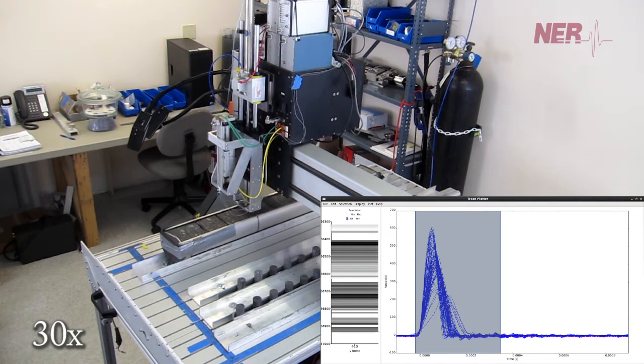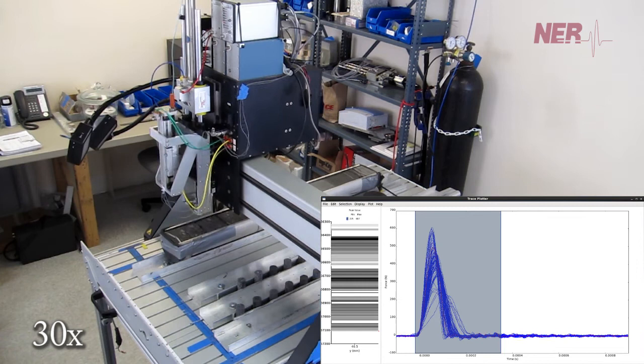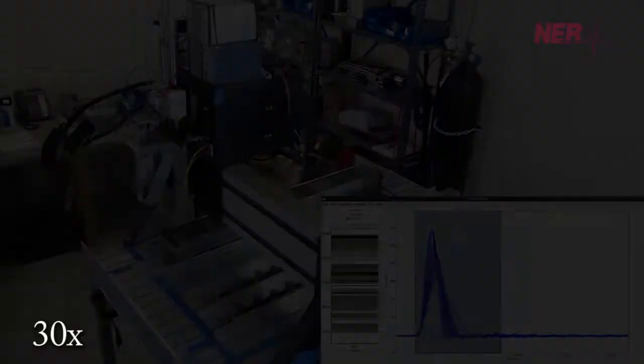The AutoScan can accommodate up to 12 feet of 4-inch diameter core at one time. An optional camera attachment can photograph the core prior to each scan, providing detailed core photographs that are automatically depth-registered to the measured data.